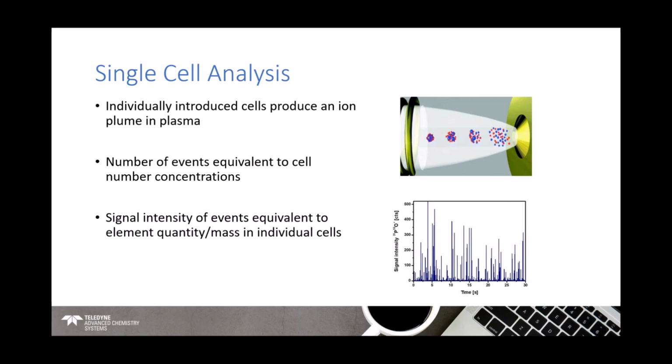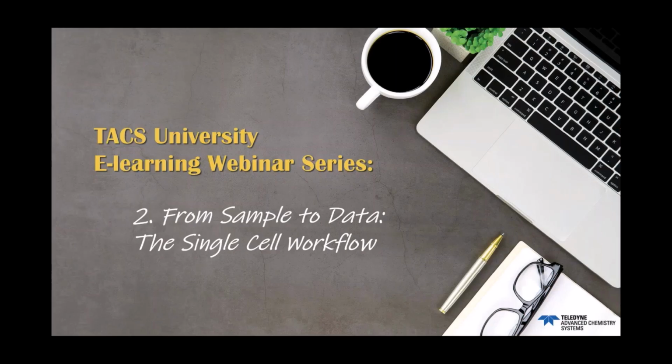So that's generally the process. But there's more to this. There has to be more to this. It's not that simple, unfortunately. So what I'm going to do next is describe the workflow of this process. What's involved in generating and capturing this data? What are the variables that we need to be aware of?